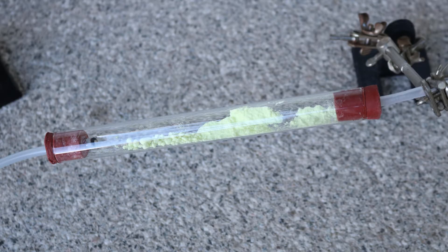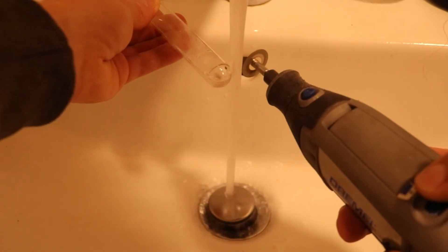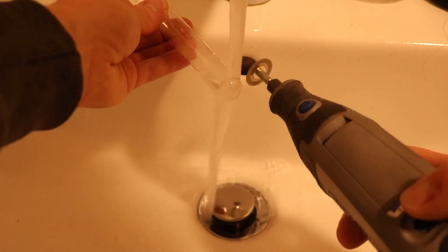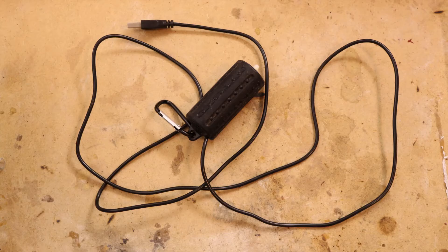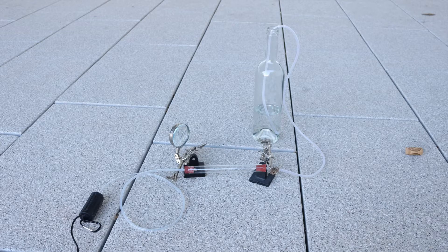To burn the sulfur I will put it into a reaction tube with air coming into one side and the sulfur dioxide coming out the other side. This has to be done outside because sulfur dioxide is poisonous. For the reaction tube I just removed the bottom of a test tube. For the air I used the aquarium air pump from my nitric acid video, and to connect everything I used rubber stoppers and tubes.